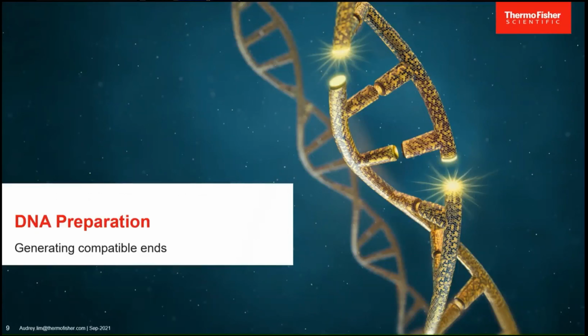Okay, so you have known the workflow for molecular cloning. Now we go into more detail, step by step, for the workflow. So let's talk about the first step: how to prepare the insert and vector for cloning.